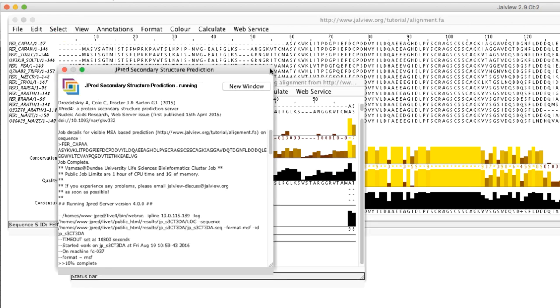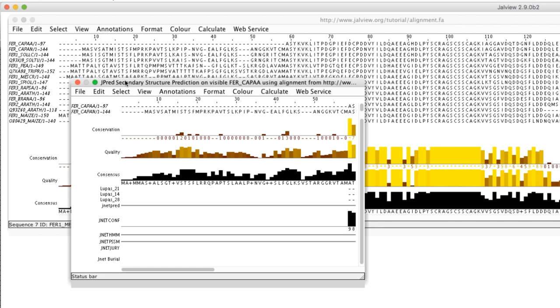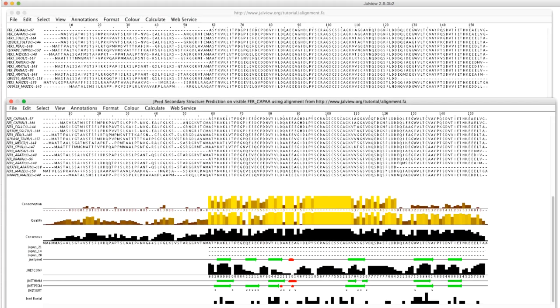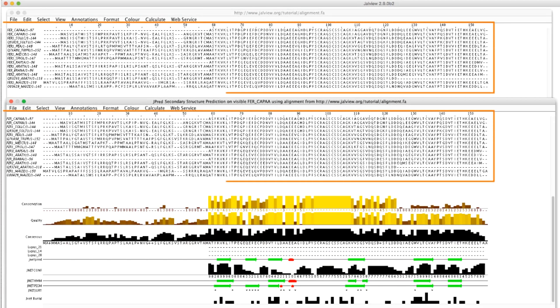Upon completion, a new alignment window opens. The number of sequences in this window matches the number of sequences in the original alignment.